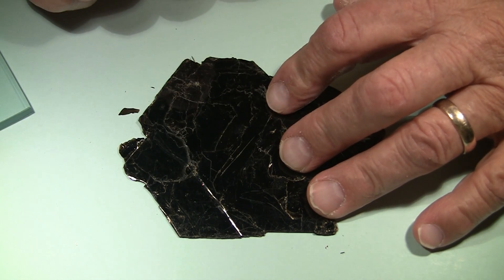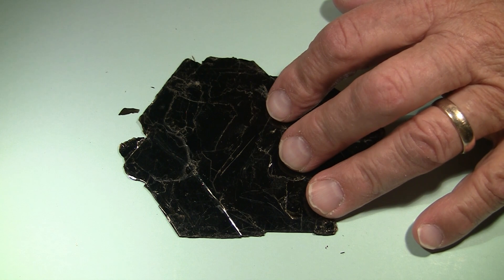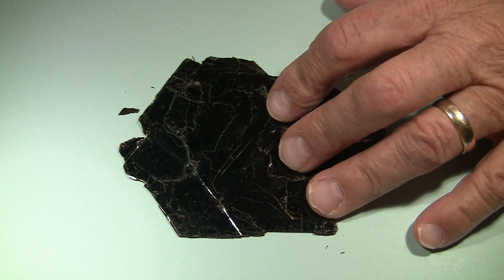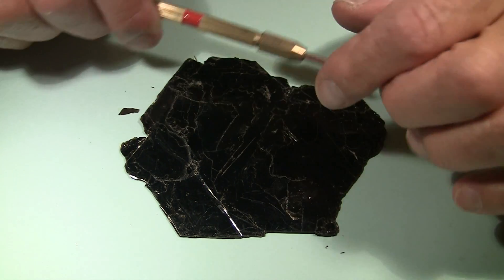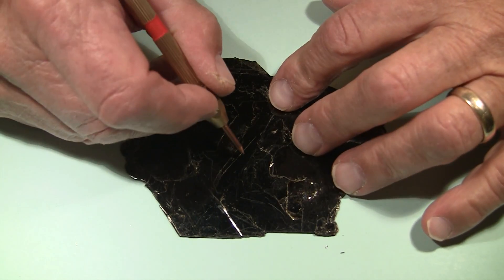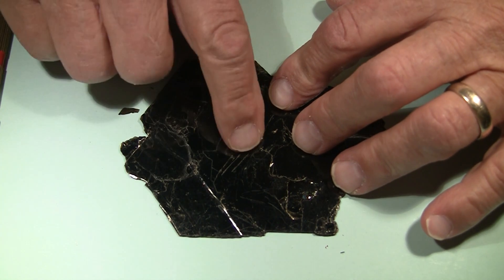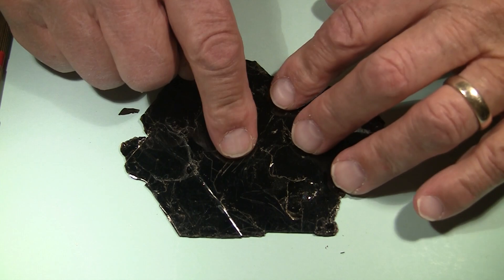Now let's see what else we can use to scratch it with. Hardness points here. Here is the number 3 hardness point, copper wire. And we'll rub that across there. I can definitely feel it scratching, leaving a mark as well.